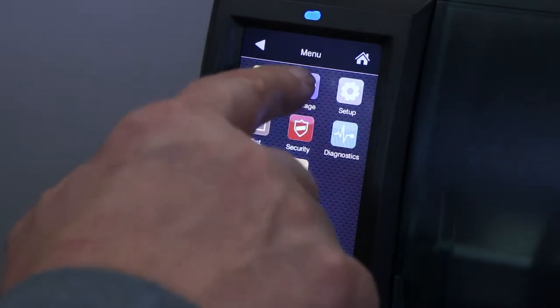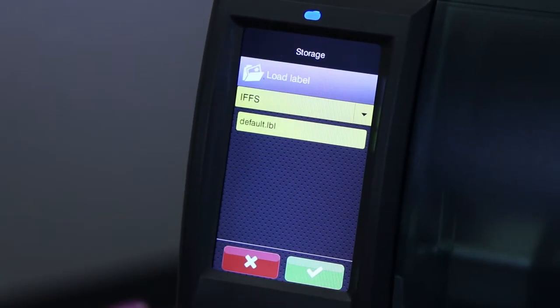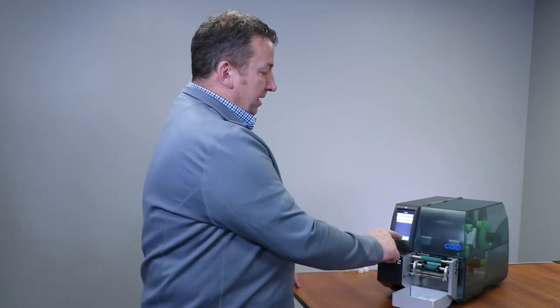So I go into the printer, go into settings, go into storage, go into load label, and I've loaded label format in there and I get checked.